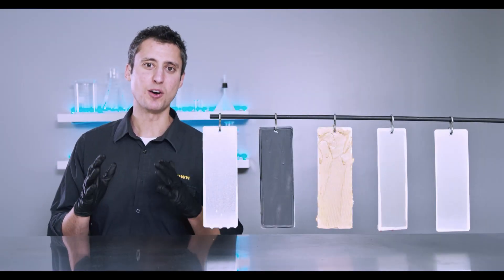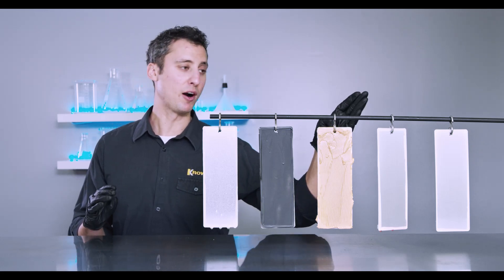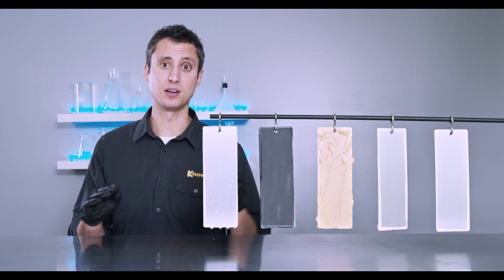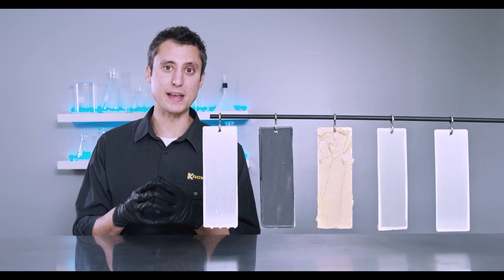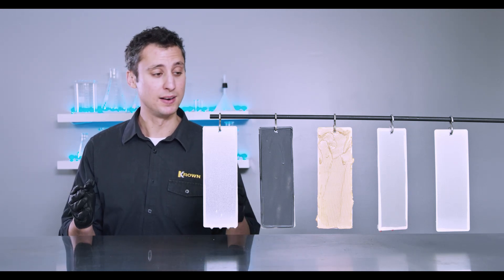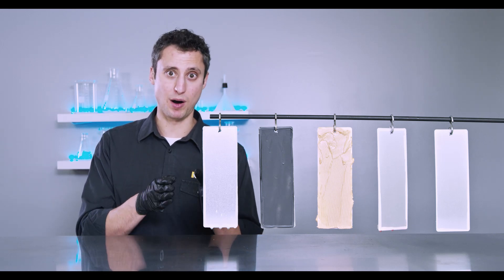So here we have our prepared samples. To walk you through each sample quickly, we've got our first panel completely unprotected, our second panel protected with a popular oil-based rust protection product, our third panel protected with peanut butter, our fourth panel protected with rust paint, and last but not least we have the Crown product.